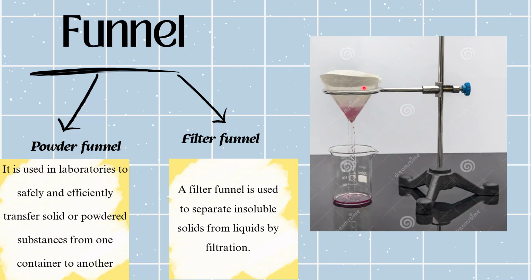So as you can see over here, I am able to separate the solid which was not dissolved in the liquid, and I'm able to separate that liquid as well. So these are the two types of funnel. But for now, we are not interested in the powder funnel. We are going to learn in depth about the filter funnel. Let's go ahead.